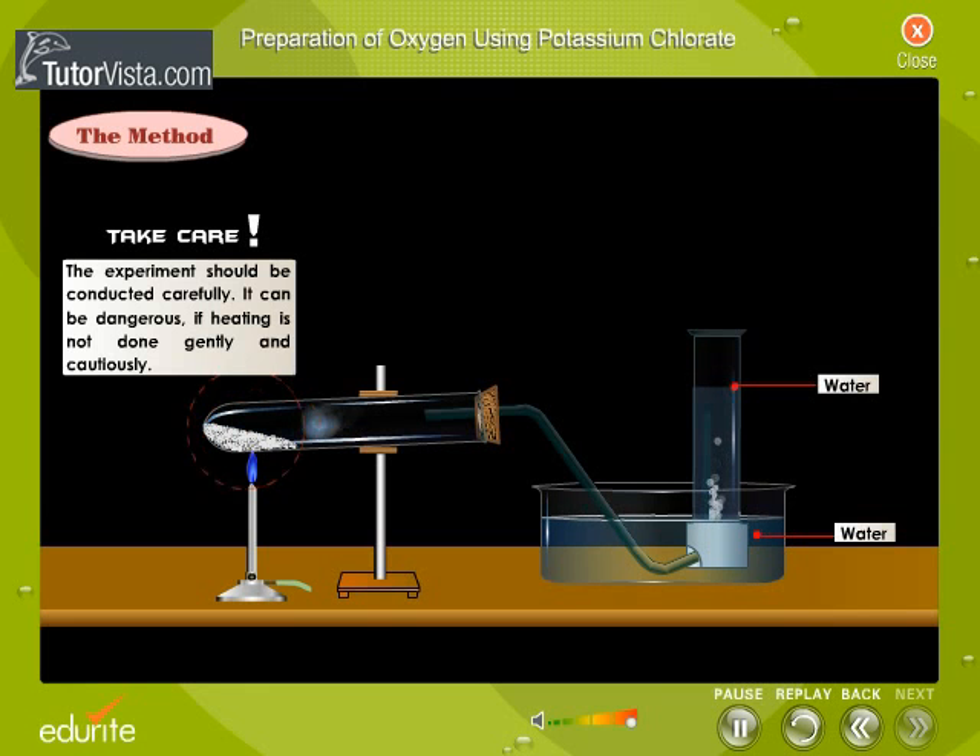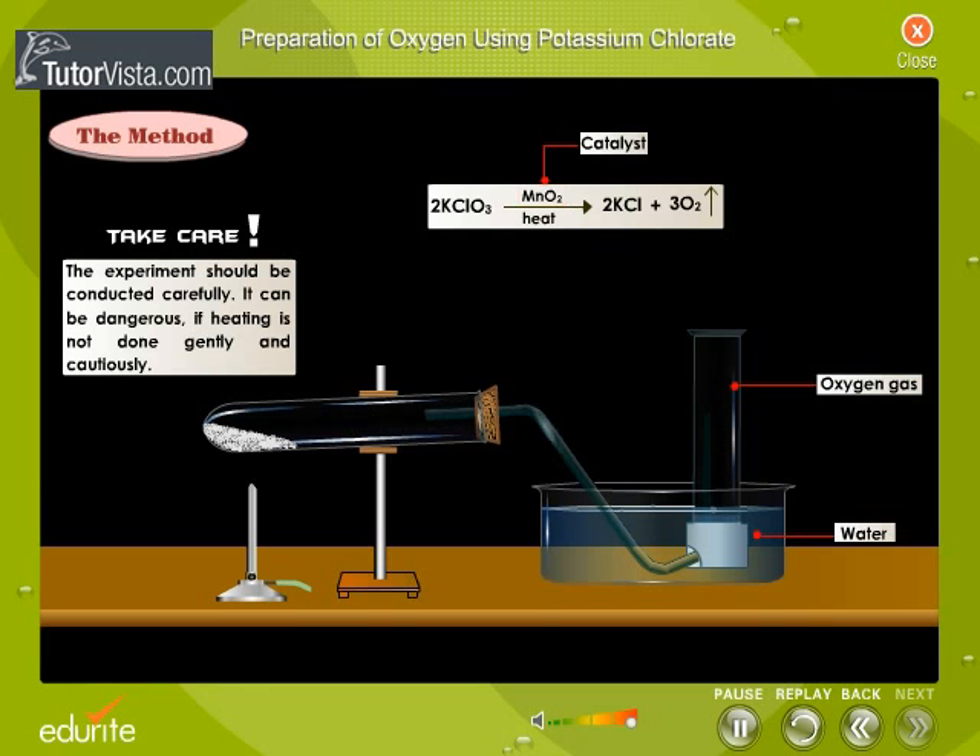Take care. The experiment should be conducted carefully. It can be dangerous if the heating is not done gently and cautiously. The reaction that takes place is displayed on the screen. Manganese dioxide is a catalyst in the reaction.